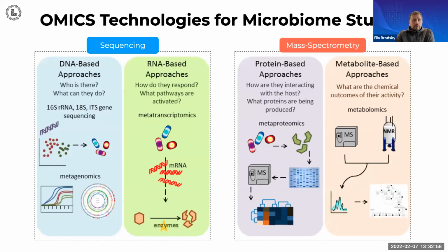So this is just one of those sequencing techniques. In fact, there are several other approaches. For example, there are RNA-based approaches, metatranscriptomics, or there's the ability to sequence not just the 16S, but, especially using long-read sequencers that have become more accessible and cheaper in recent times, either the full 16S ribosomal RNA gene, which could provide the ability to better characterize the lower levels of taxonomy in more detail, or in some cases even assemble the actual full genome. That could be extremely interesting because we can only rely so much on knowing one individual gene and assuming that everything else stays the same.